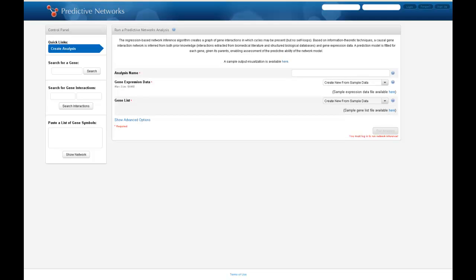In this video, we'll be introducing the Predictive Networks web application, a flexible, open-source, web-based application and data services framework that enables the integration, navigation, visualization, and analysis of gene interaction networks. The primary goal of Predictive Networks is to allow scientists to evaluate gene lists in the context of large-scale gene interaction networks built from a comprehensive collection of known gene interactions extracted from public resources, including full-text articles in PubMed Central, as well as from a user's own genomic data.